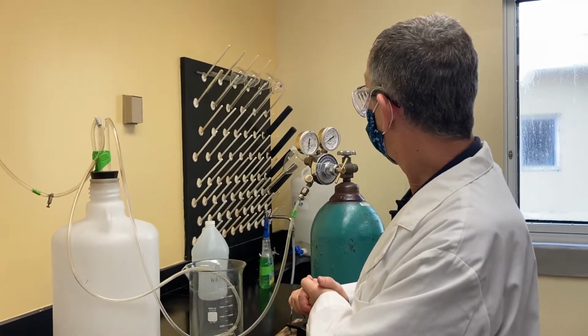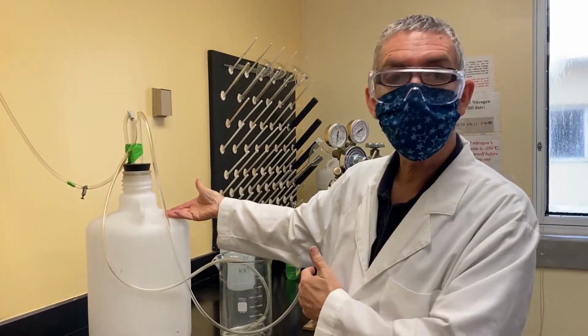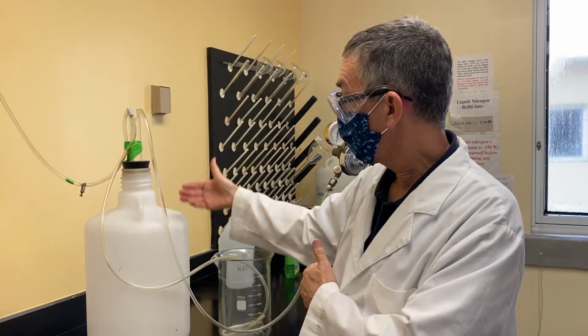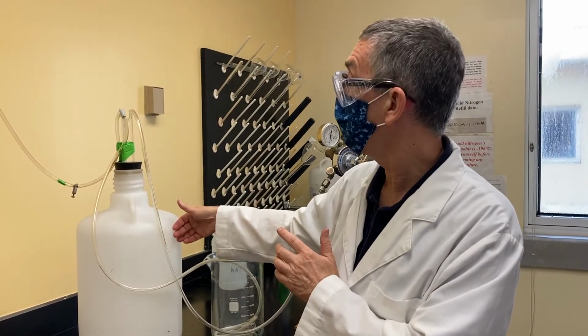The principle is going to be that we first purge this, which is currently filled with air, with our argon gas, about 15 minutes the very first time. So this is pure argon, or very nearly pure argon.